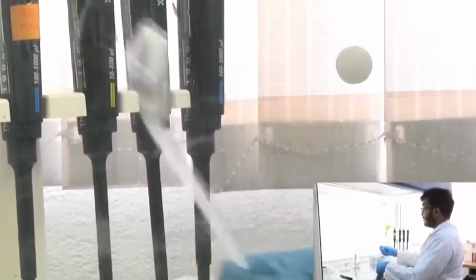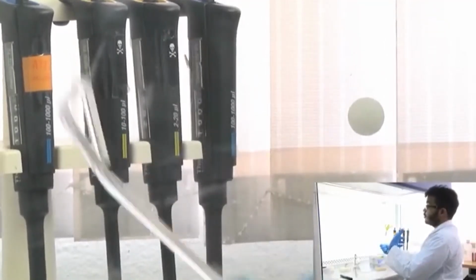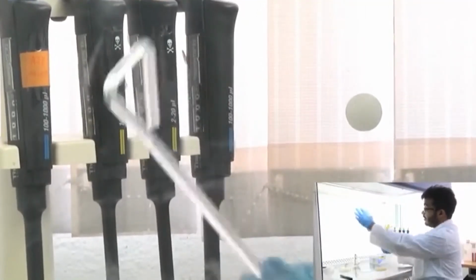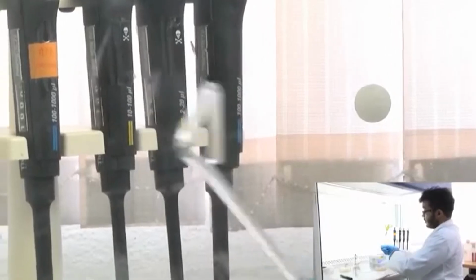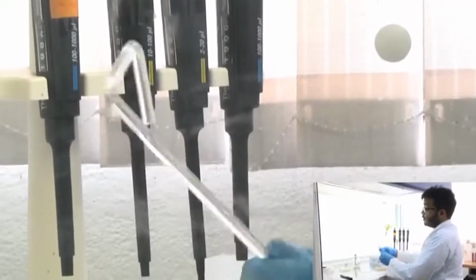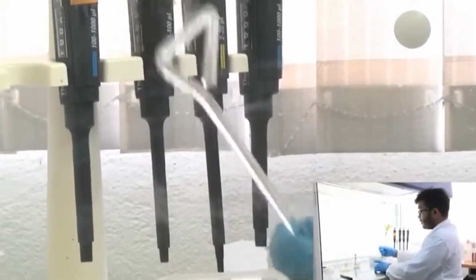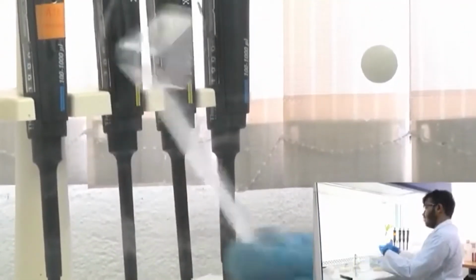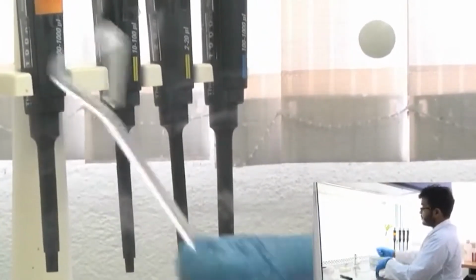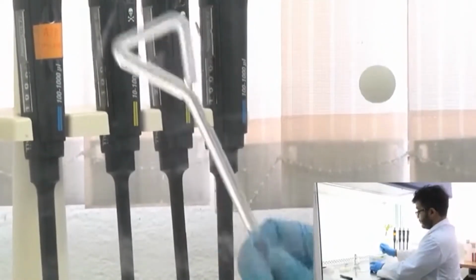And I repeat once again that normally when you are working in the laminar airflow hood, you should not talk, because as I'm talking there is a possibility that I might spit into the lab, or the breathing that I'm doing might overcome the positive pressure of the laminar flow, and I have an open plate here, right? In case I'm spitting, then bacteria from my mouth might also be there, and who knows, maybe it is resistant to this antibiotic, in which case I'll get a false colony. So when you are carrying out your experiments, or even when I'm doing my experiments, no talking in front of the hood. For this demonstration purpose, it can't be helped, but always keep in mind, the lesser you speak, the better.